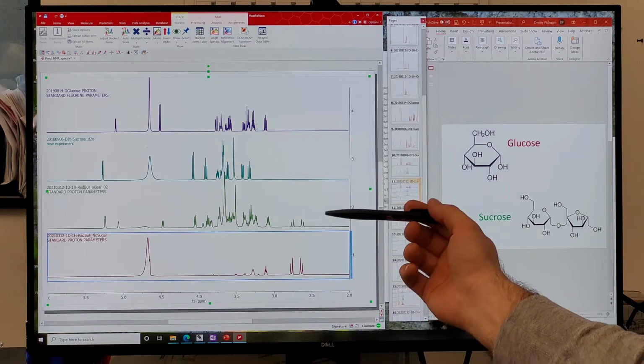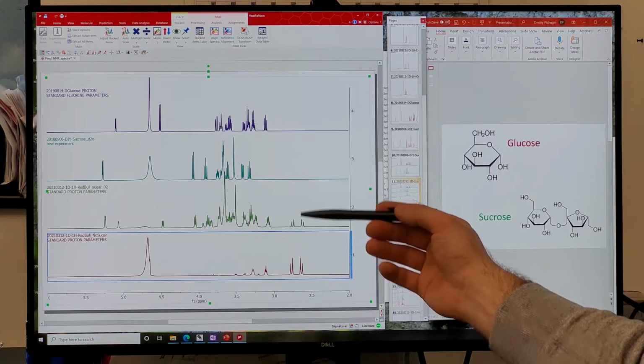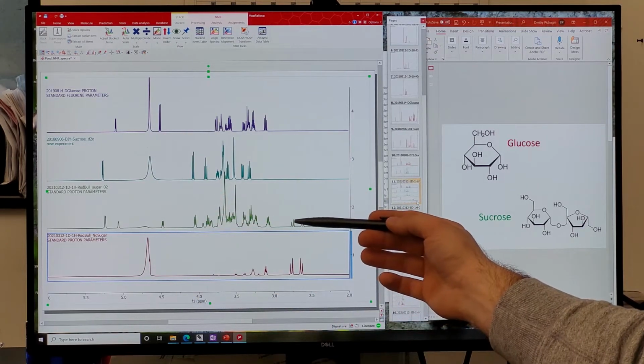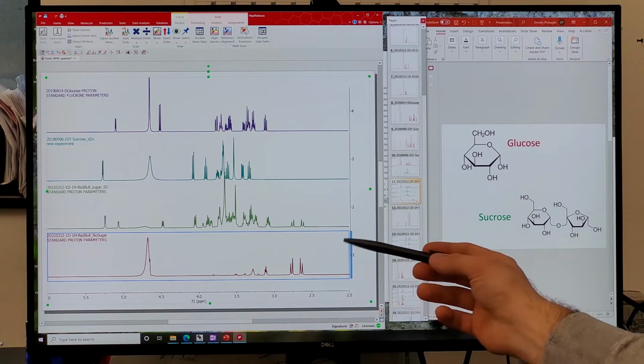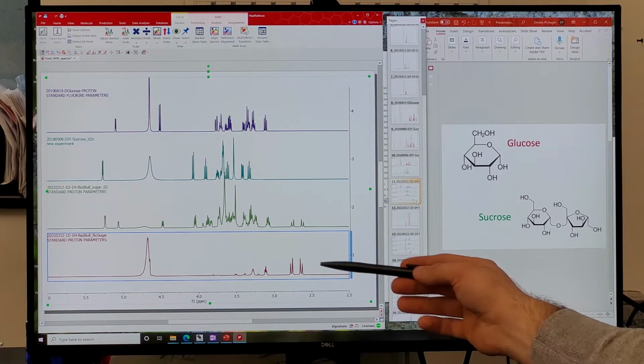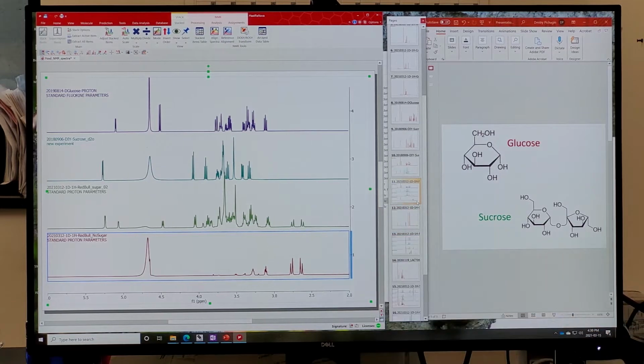Interesting is also to look at the Red Bull with and without sugar, where sugar is a very dominant component, but also, for example, you can clearly see citric acid, and you could easily use these peaks to quantify it in both of the solutions.